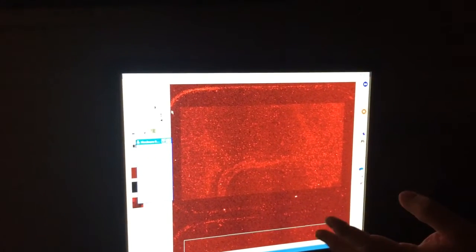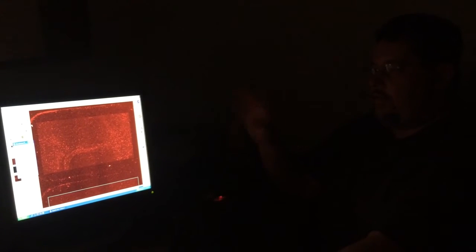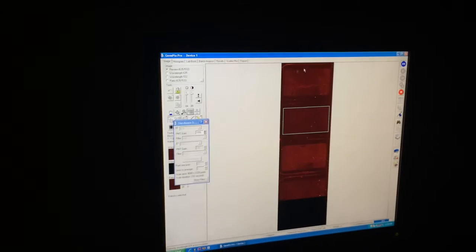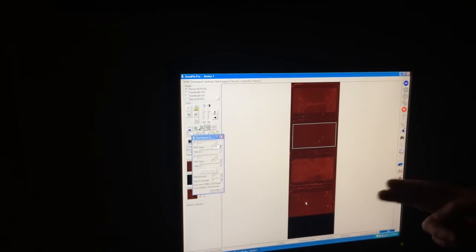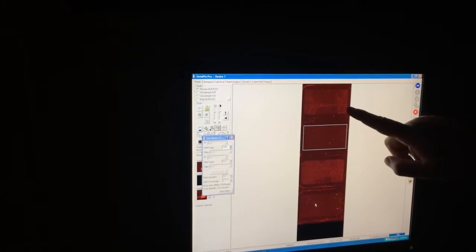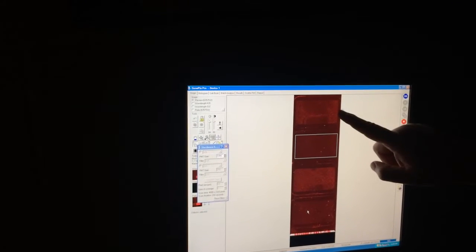Again, there's going to be two lasers because we're looking at two different treatments. In this case, hypothetically, we're looking at a treatment where a caterpillar was treated with a bacterial pathogen and without a pathogen. And so we're going to compare those two different treatments. So we labeled them one red and one green. I'll explain that in another presentation. So this is just strictly on how the scanning occurs. Anyway, you can see that the overall image of the glass slide is being scanned right here. And you'll notice that there's four blocks and those represent four arrays. So on this chip, there's actually four microarrays. Each one of these microarrays represents 44,000 spots.